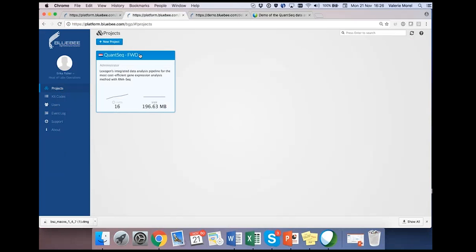Thanks. Is it possible to adjust the analysis pipeline to include TopHat and Cufflinks? It could be, but it will take longer. We wanted to have the pipeline working for forward and reverse.